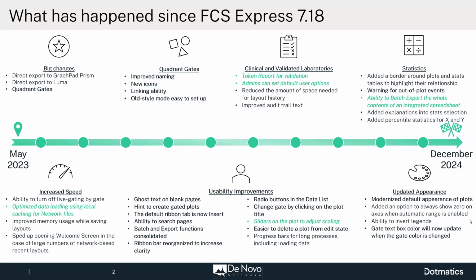We've also updated the default appearance of plots. If you remember, for a long, long time, we always had plots that had red borders around them. There were borders around titles. We've completely updated those plots to look a little bit more like what we see in other places. And hopefully things will look the way everybody likes them.